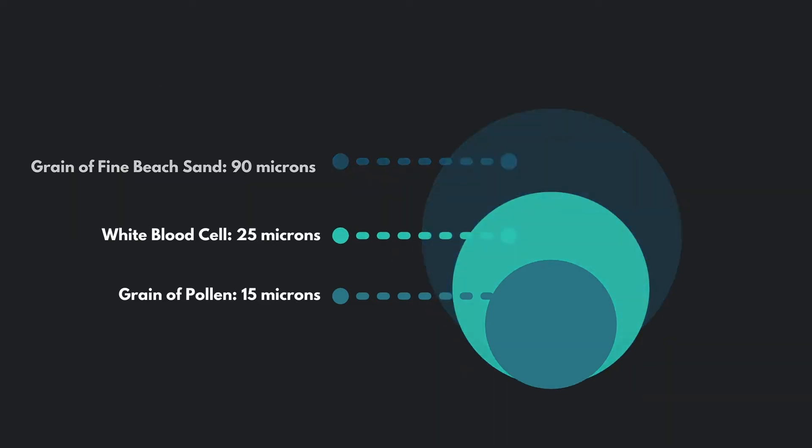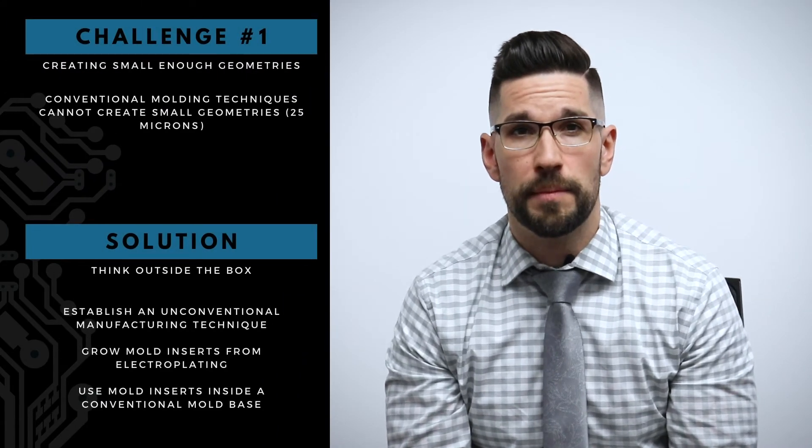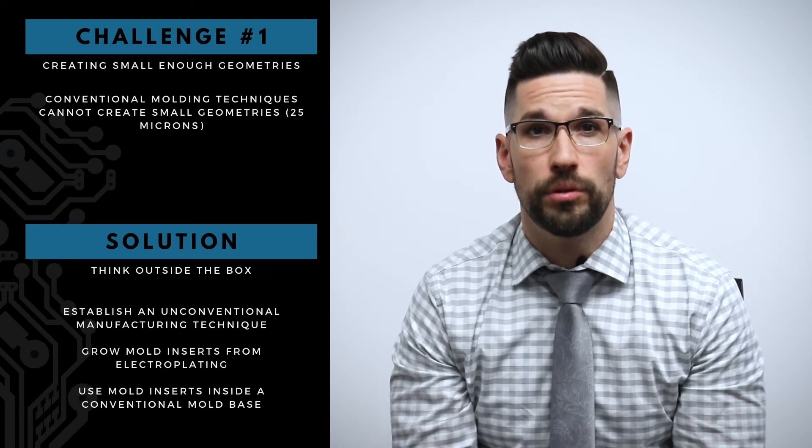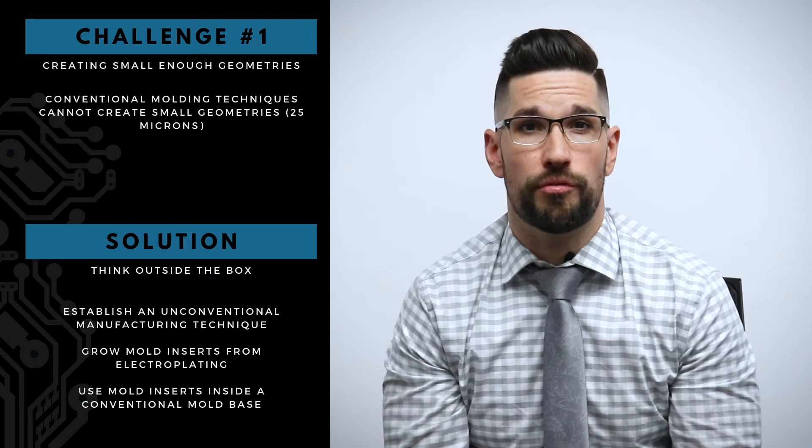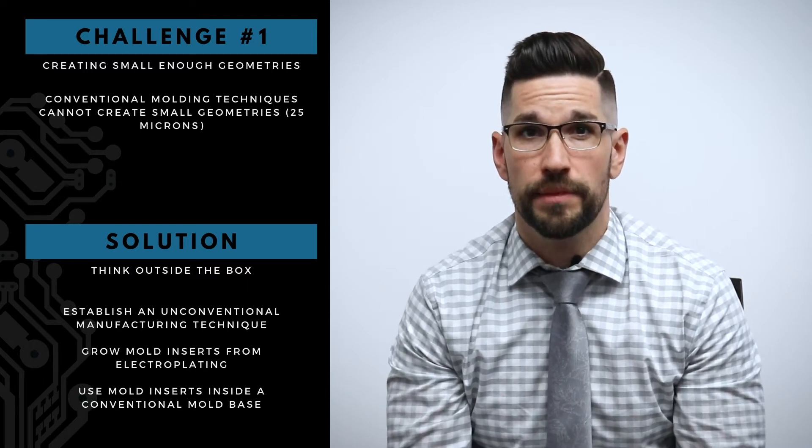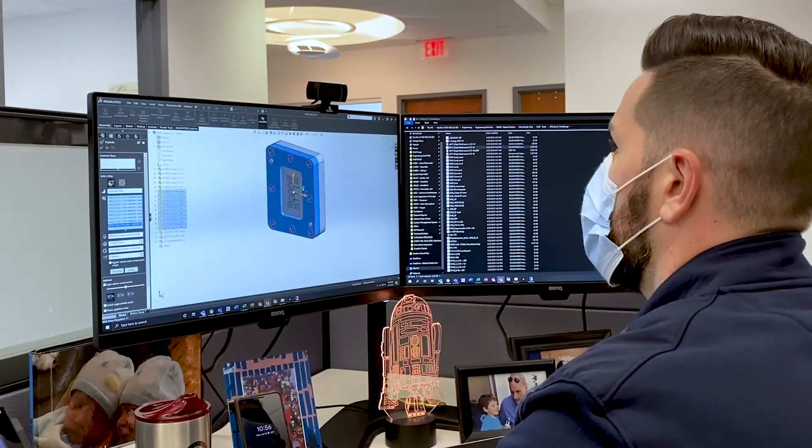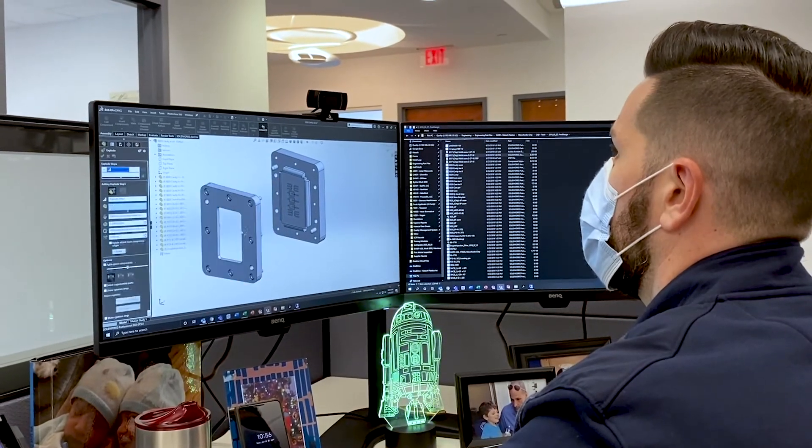So when you're considering something that small, you have to go outside the box and investigate different types of manufacturing techniques that can make a mold insert of some kind with features that are that small. So what we ended up establishing was an unconventional manufacturing technique that's kind of comparable to 3D printing, where mold inserts are basically grown from the electroplating process and we're able to utilize those mold inserts inside of a conventional mold base.